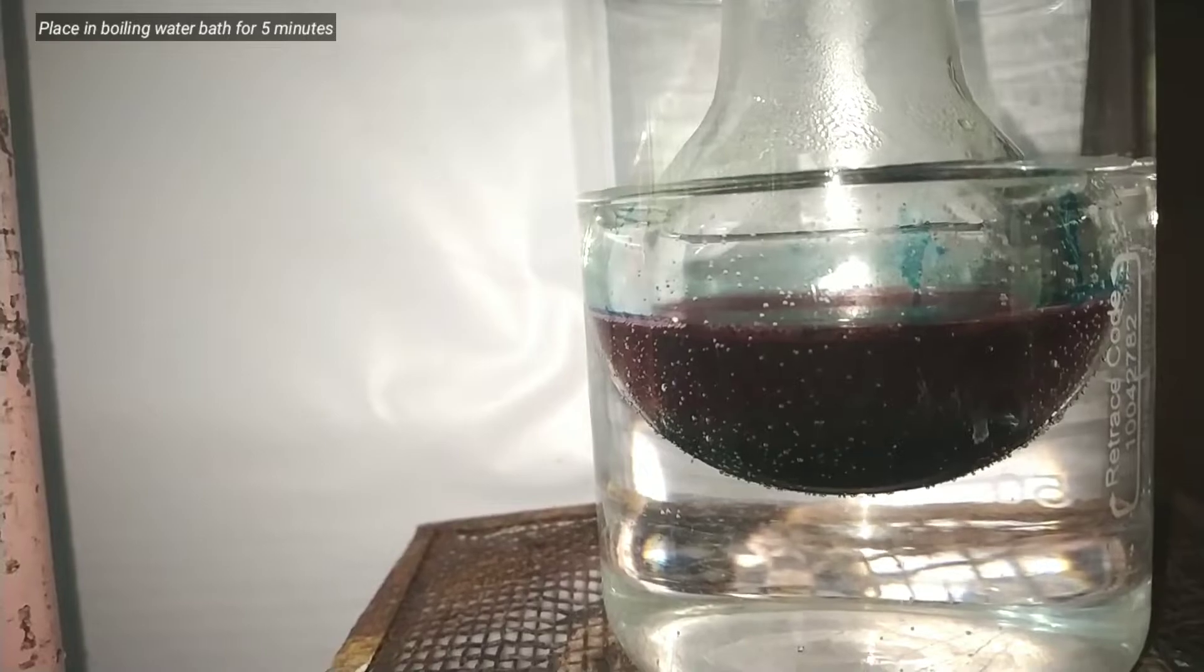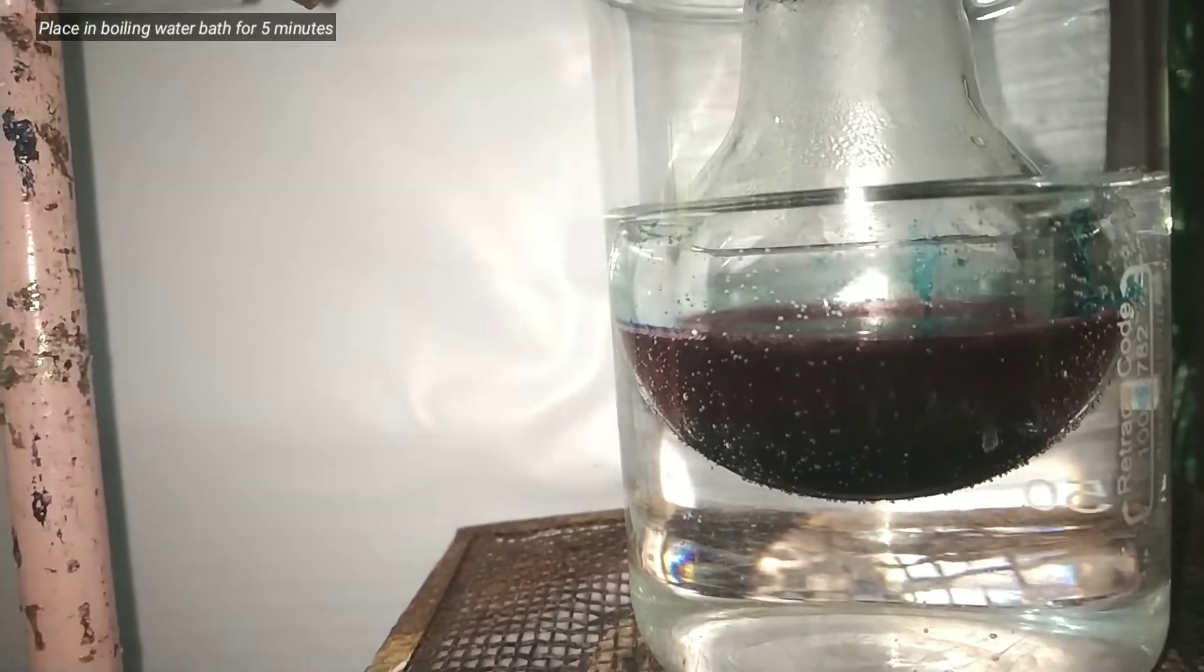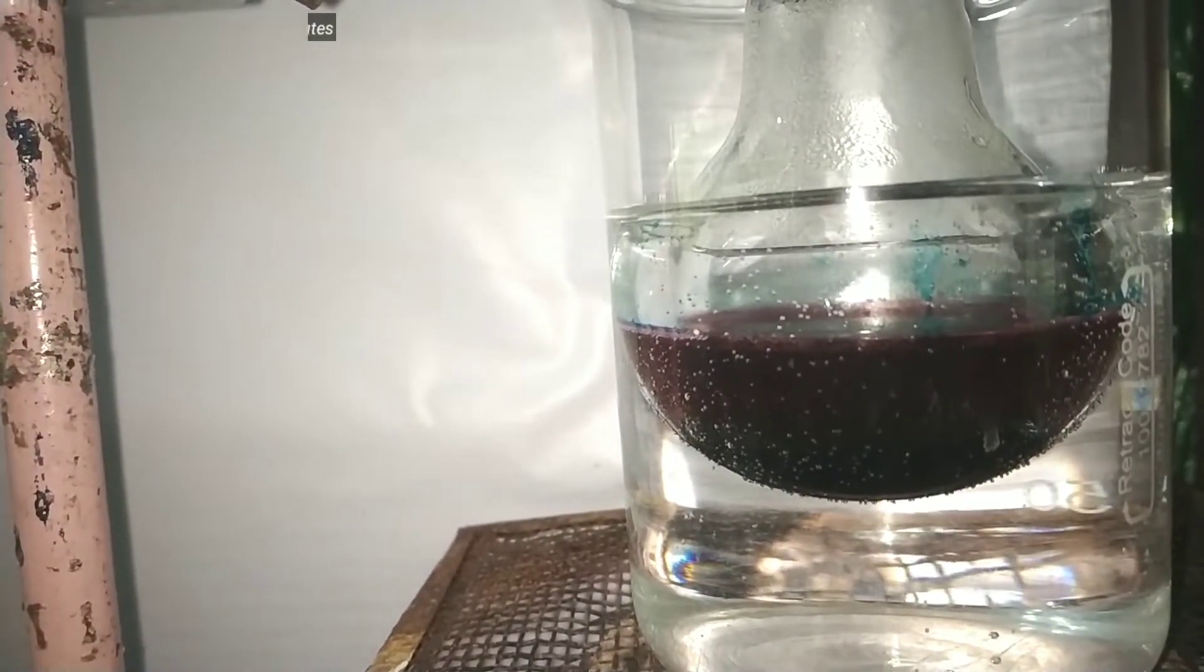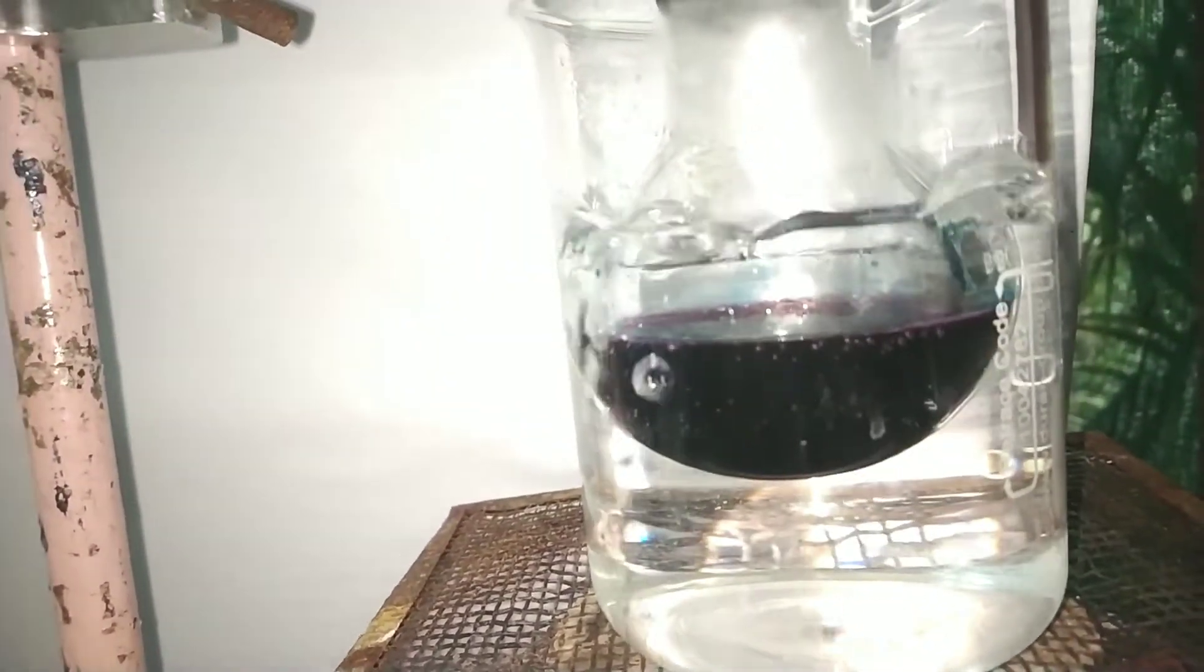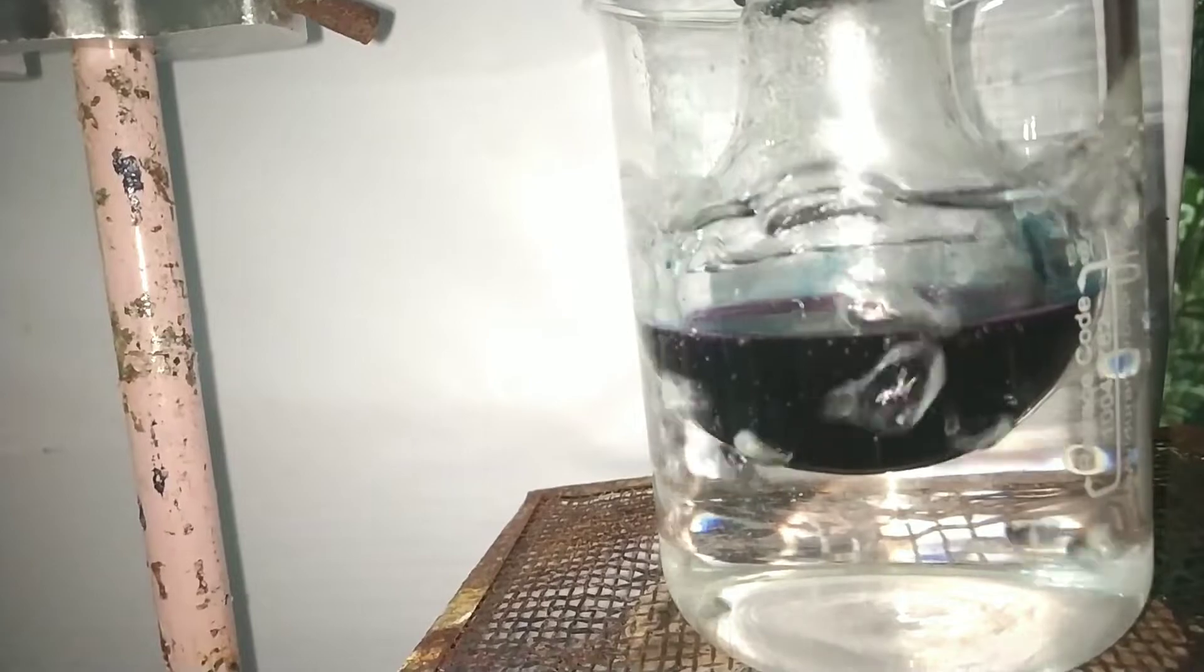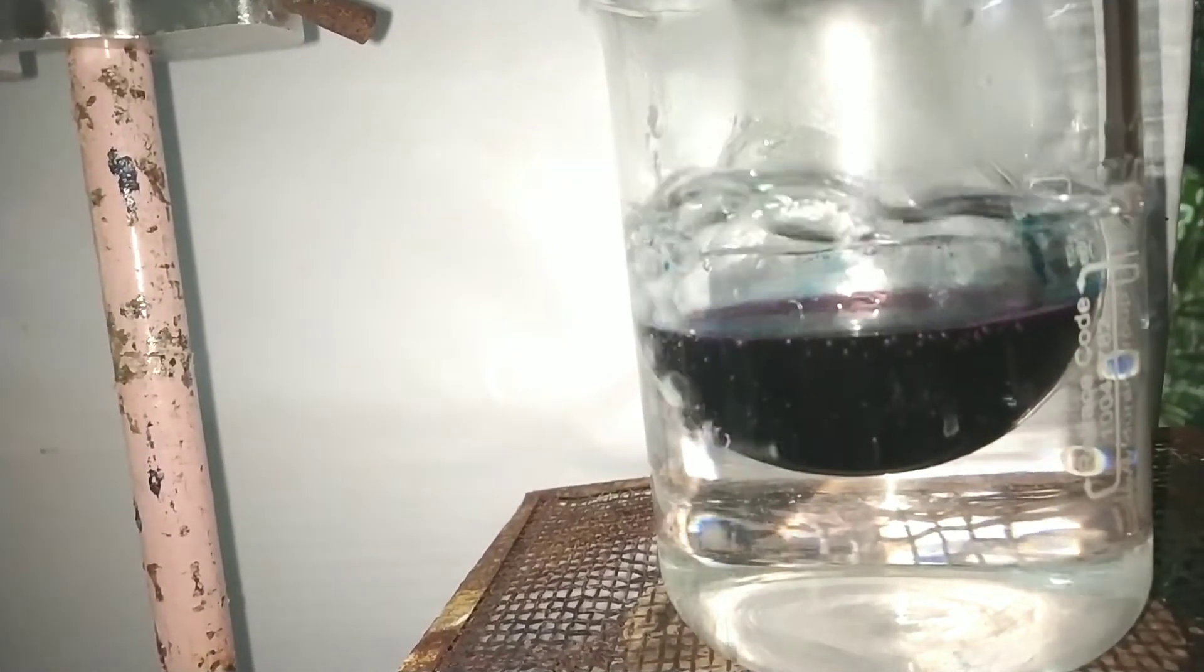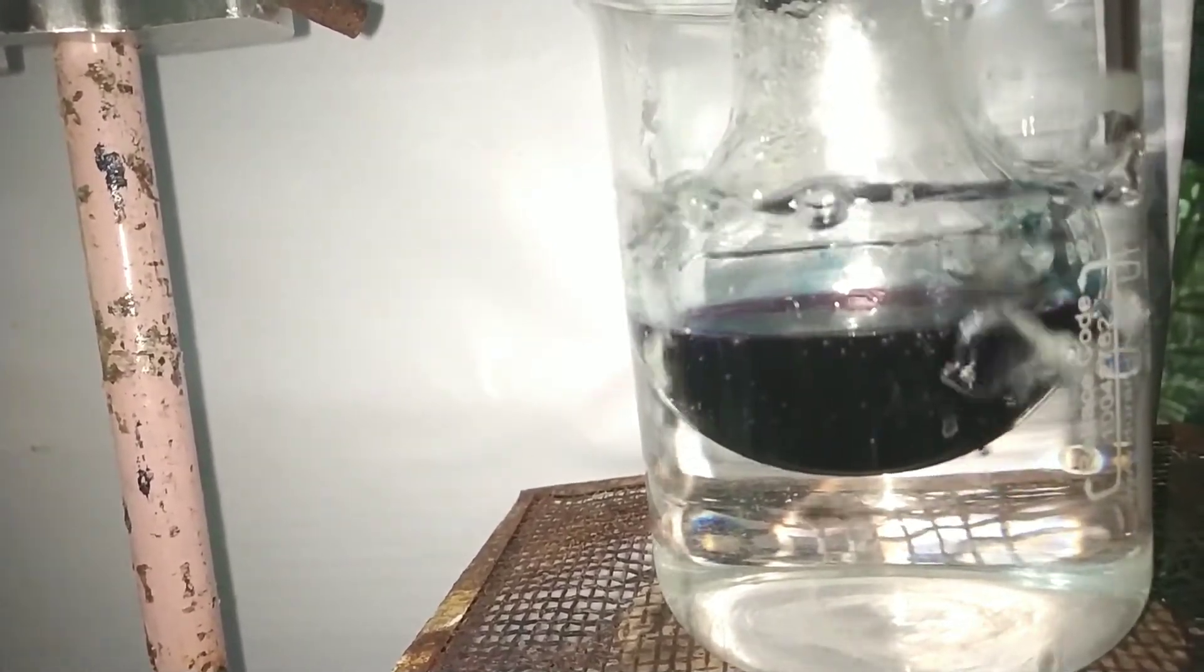Now the flask is placed in a boiling water bath for 5 minutes. You can see that the blue color is intensified as the cobalt(II) chloride salt on increasing temperature gets a blue color. This along with the tetrathiocyanate of cobalt complex gives the blue color.